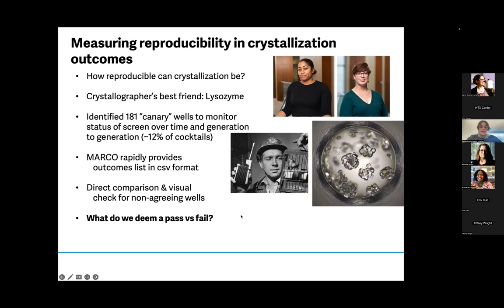The last thing I want to mention is that right now we don't have a statistical cutoff for what we deem a pass versus fail in our screen, but this is something we're going to be working on with Miranda Lynch, our resident statistician. We look forward to developing this and figuring out exactly when the screen no longer passes our QC analysis. But I'm happy to report that our Generation 21 report card scored an A on reproducibility, of about 96.7%. So we're very highly confident that Generation 21 is going to work at least as well as the past generations, if not better.